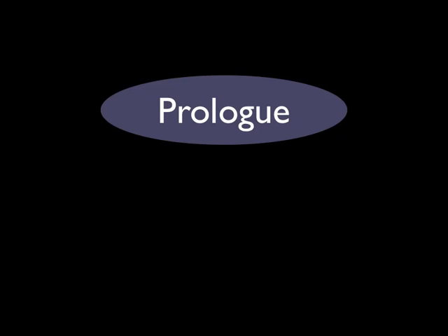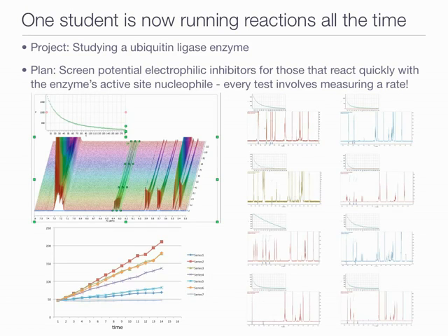The prologue for this: the course was in the winter quarter. Since then, I've found one of the students coming in over and over to one of the spectrometers here, running reactions, and so I said, hey, what's going on? So it turns out that he really has gone to town with this. He took what he learned in the course to study this ubiquitin ligase enzyme, which I can't say too much about because it's not really reported yet. But they're now screening for inhibitors by monitoring reaction rates.